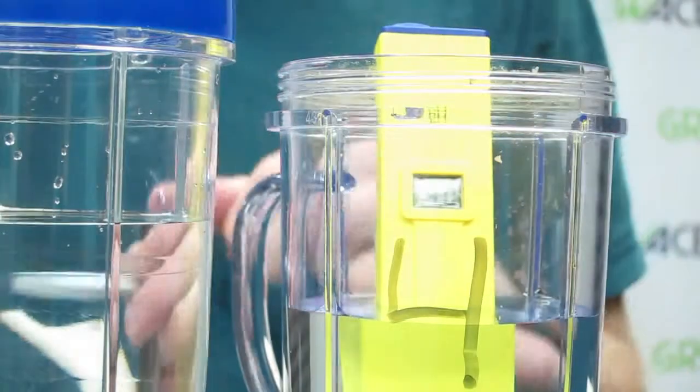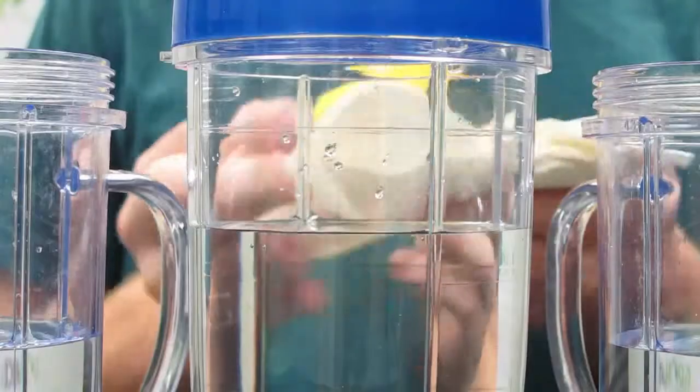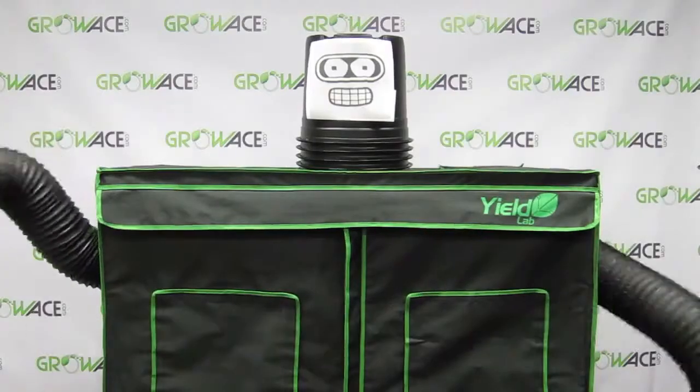Once you adjust it with the screwdriver, rinse it one more time and dab it dry with a napkin. Calibration is complete. The main use of a pH meter is to measure the acidity and alkalinity of your plants' water, especially with adding nutrients in a hydroponic setup. A balanced pH in your water and soil allows for maximum nutrient uptake.